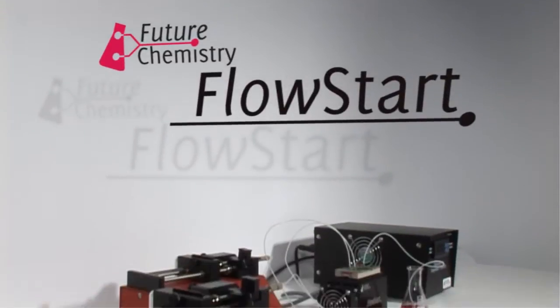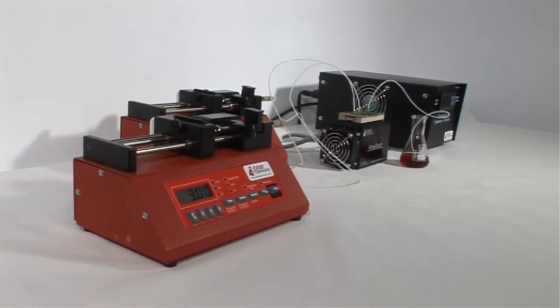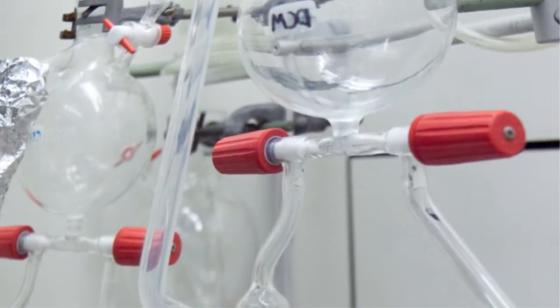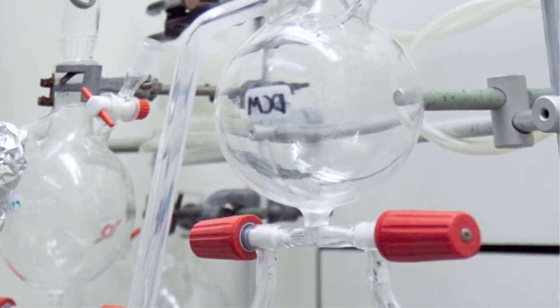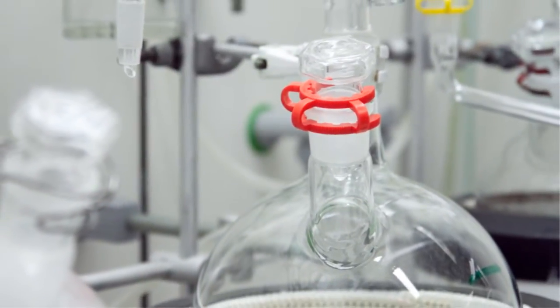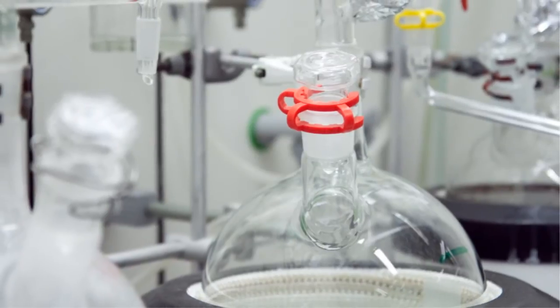FlowStart: Start working with flow chemistry today. FlowStart is a complete package for flow chemistry. Even today, most chemical reactions are performed in common glassware such as round bottom flasks. Consequently, this method is a batch mode process.